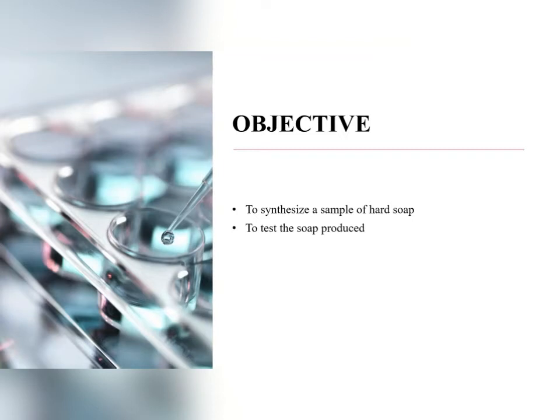The objective of the experiment is to synthesize a sample of hard soap and also to test the soap produced to see how it reacts with other substances and also to check what components are present in there using FTIR spectroscopy.